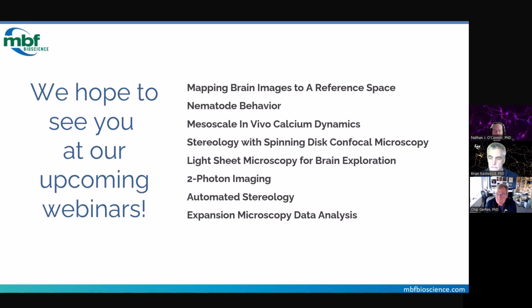And we had another question. Just to clarify, the software reconstruction can be run not just on brain tissue, but it can also reconstruct things like organoids. That is correct. You can put in a series of images and reconstruct a volume of any organ. It's when you go to do the mapping to an atlas space that you need that atlas to exist. And right now we support rat and mouse. Just a little clarification on that, because that came through as a question again.